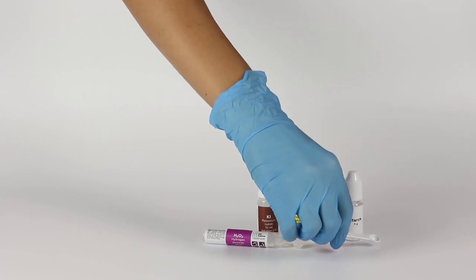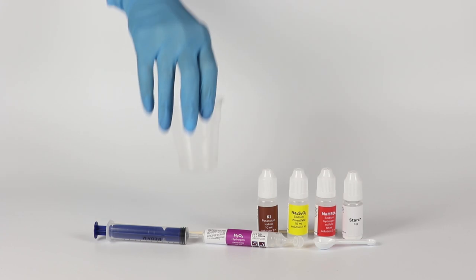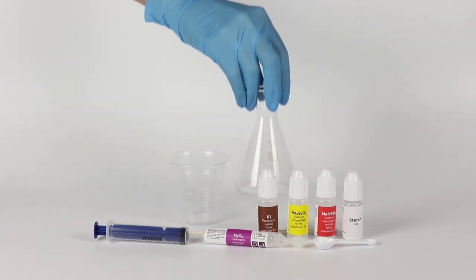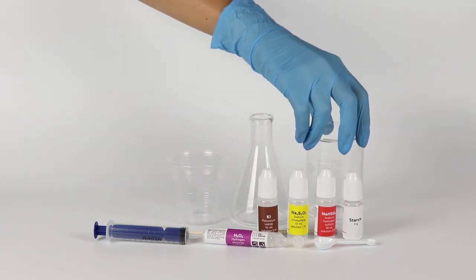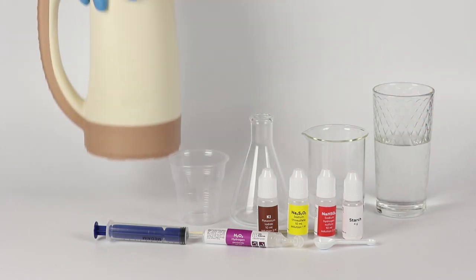Take a double-ended measuring spoon, a wooden stick, and a syringe from the experiment set. Take a disposable cup, a flask, the beaker from the starter kit. Also, prepare some cold water and boiling water in advance.